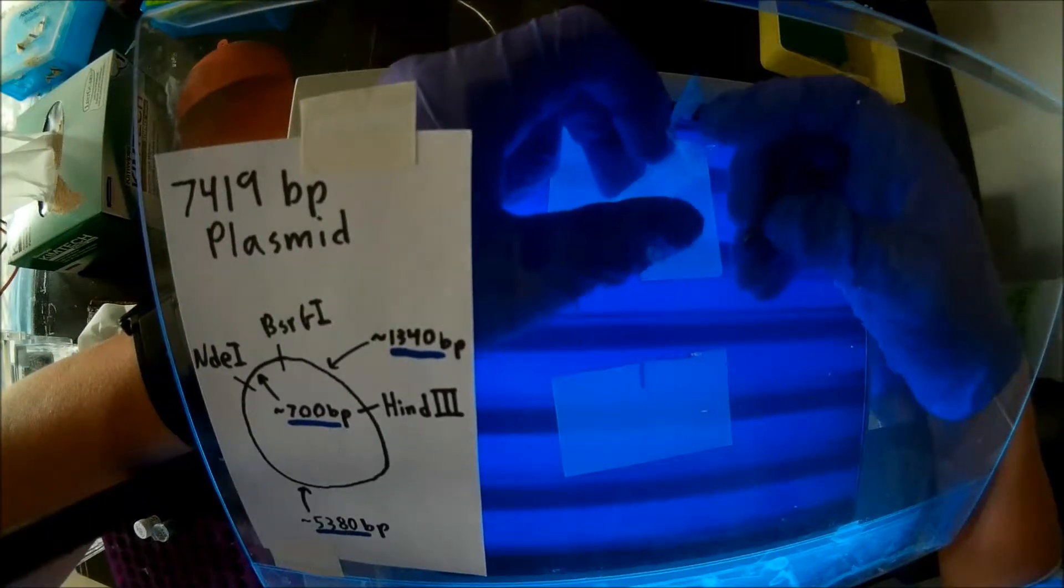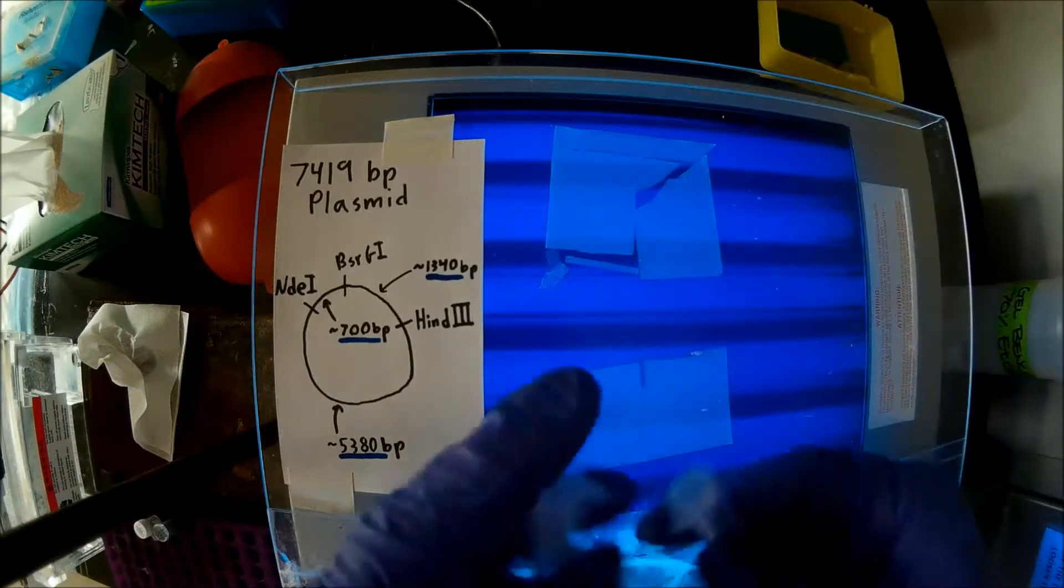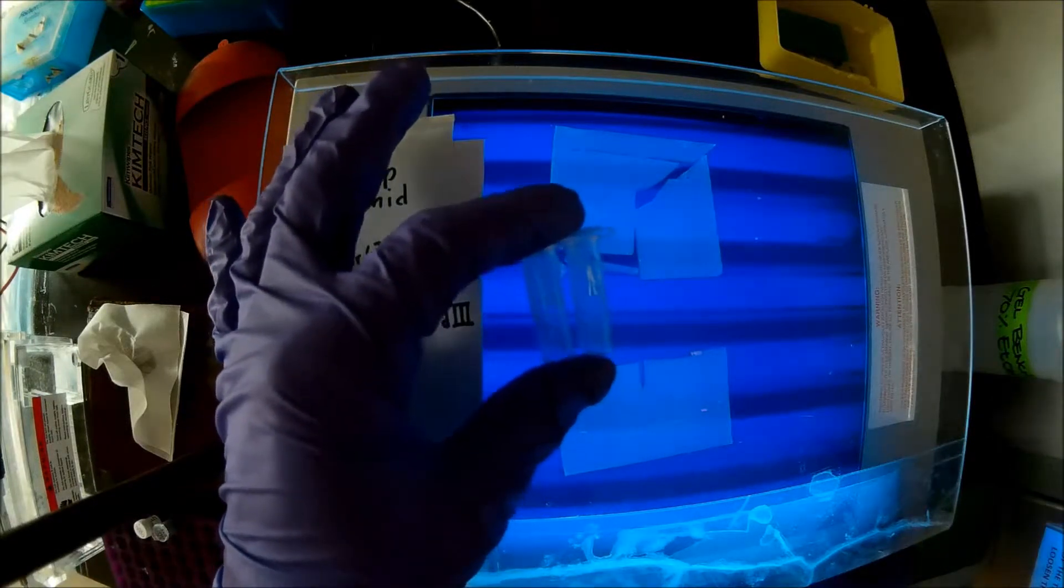Now, I'm going to clean that off obviously, but these two gel slices are ready to go into a gel extraction.